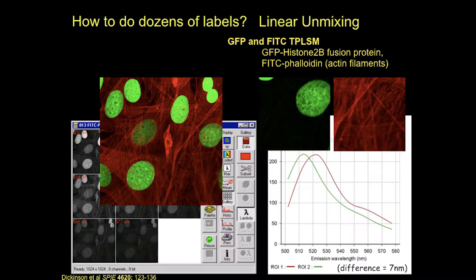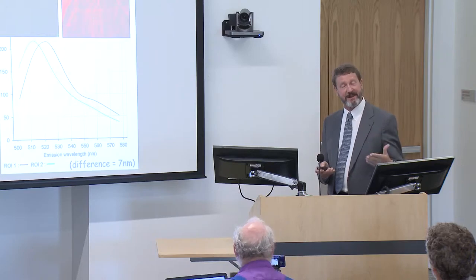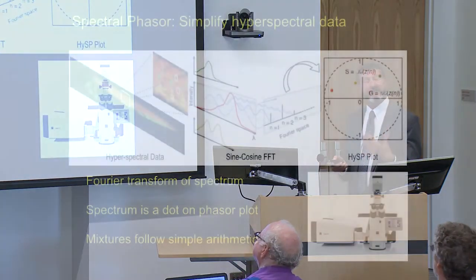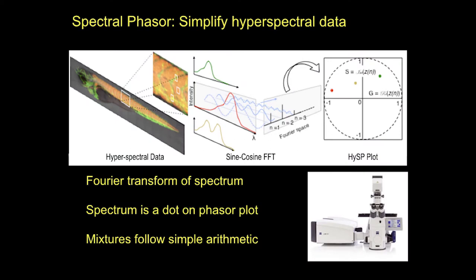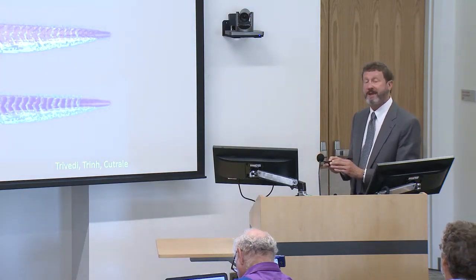There's a little bit of noise propagation, and that noise propagation is a problem because we're always limited by the worst channel. It's sort of like an academic department. The noisiest channel dominates. And so what we needed to do is to come up with a different way to get away from that source of noise. And luckily, Enrico Gratton at UC Irvine had worked out a way for lifetime imaging, and we applied this over to multispectral imaging. So if we take a spectra and take the Fourier transform of it, that spectrum of 32 bands becomes that dot. This red one becomes that dot, a 50-50 mix becomes a dot halfway in between. So all the inverse mathematical problems that were haunting us become a forward problem. It means it's both much better performing and much faster.